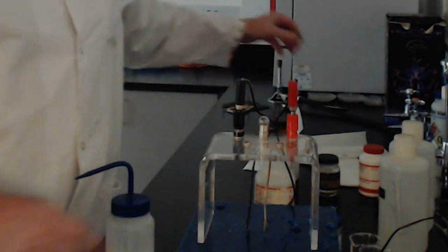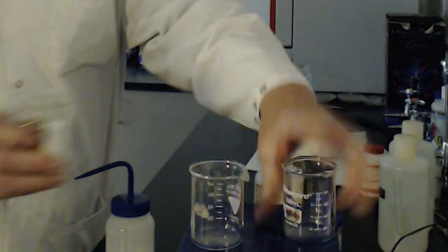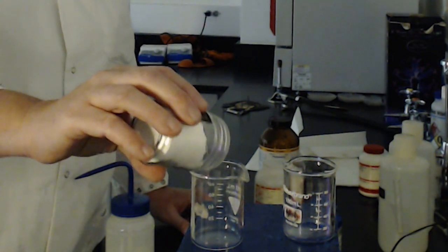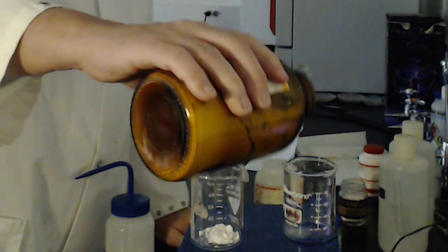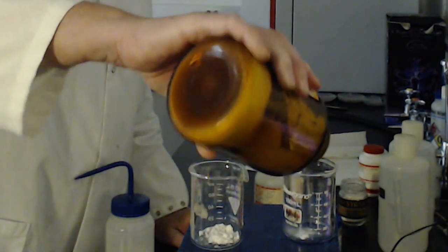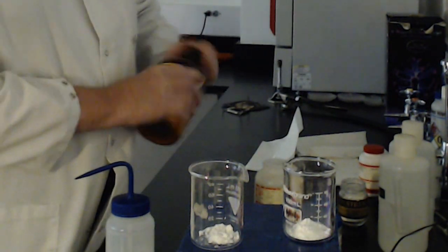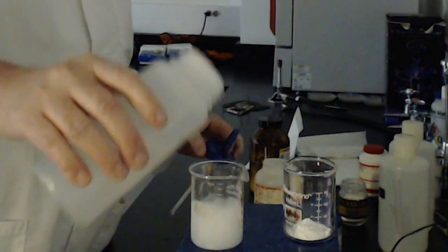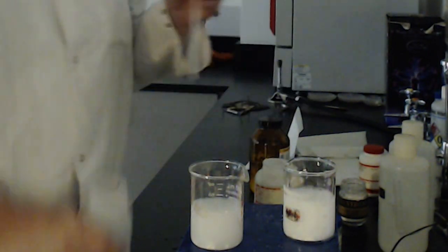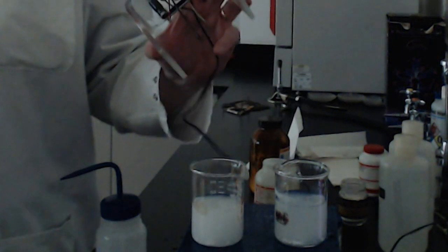Okay. Other compounds, ionic compounds, we're going to do two tests now. Calcium sulfate and magnesium sulfate. So this one is calcium sulfate. These are the classic milk salts that come in your milk. And if you drink skim milk, this is all you're drinking, are the magnesium and calcium sulfates. Okay, to both of them, we'll add pure water again. We just made some skim milk. Very nice. Okay, now let's dim the lights down again, and we're going to test them.